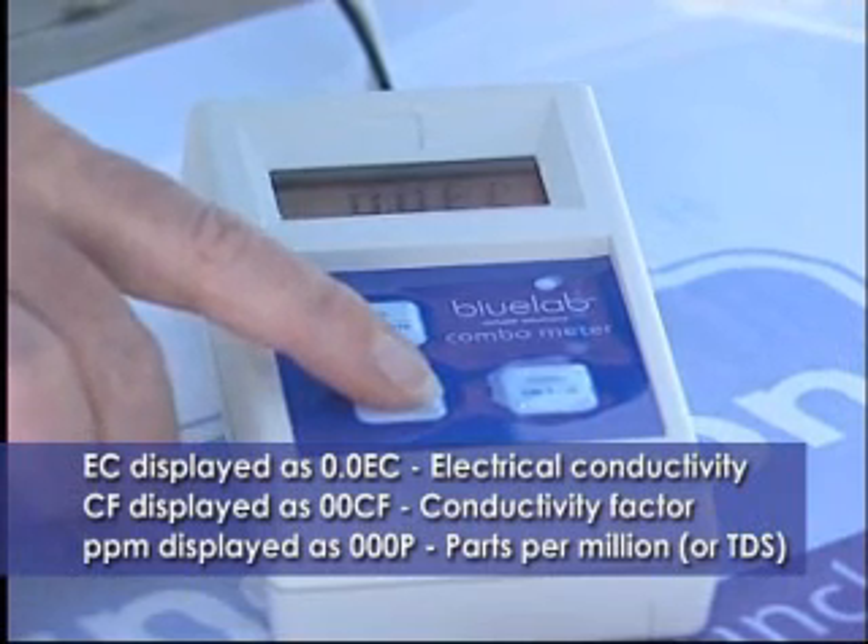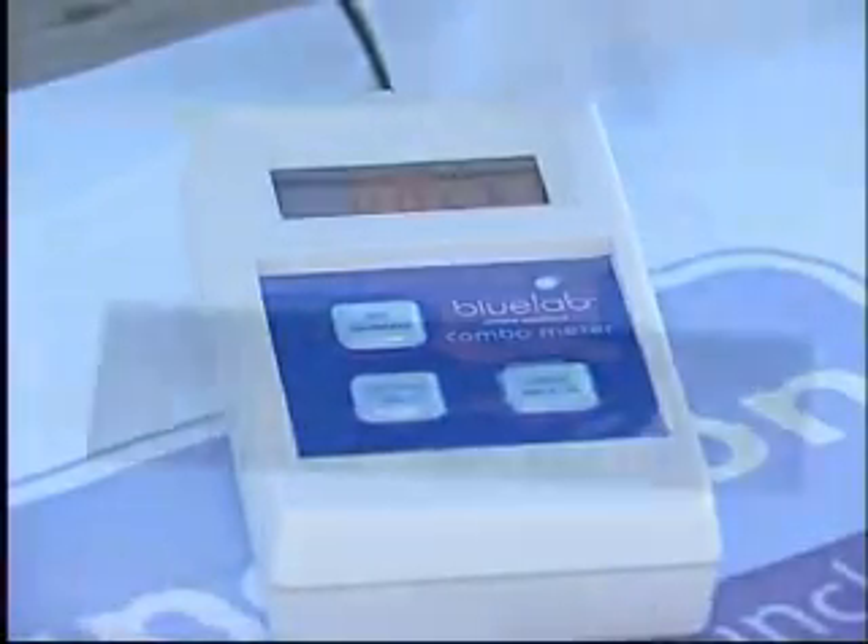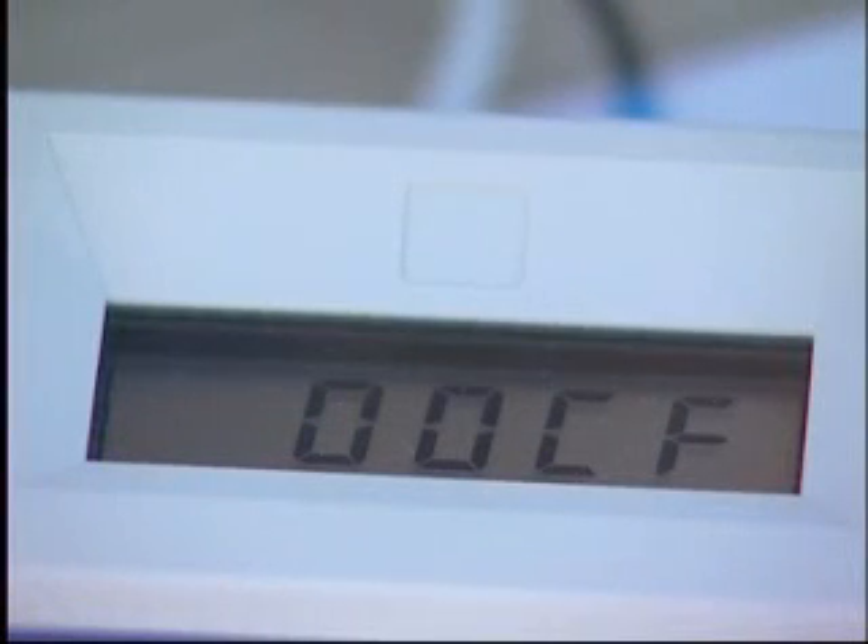While the on-screen display is flashing, short-press the nutrient button repeatedly to skip through the available scales. When the appropriate conductivity scale is displayed, leave until the on-screen display stops flashing. Your new conductivity scale has now been activated.